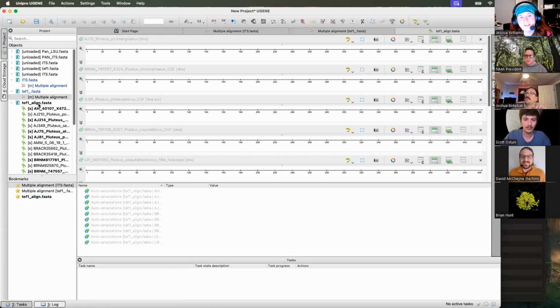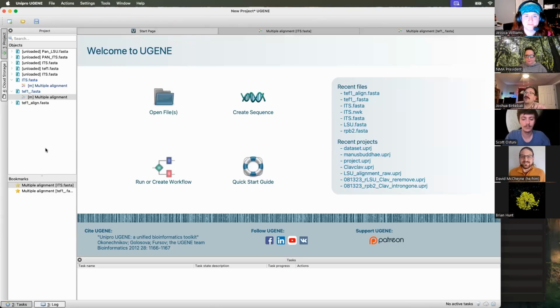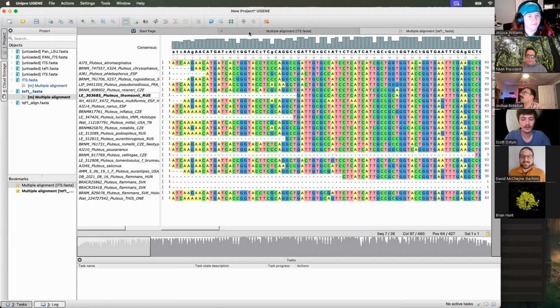strongest. For some reason, if you add to project, it just puts every single sequence in here. Jeez. There's nothing wrong with it, but it's doing something and I don't know why. And I just check the box. Especially if I'm working with a bunch of alignments, it just gums everything up. So that's why I usually check that box.